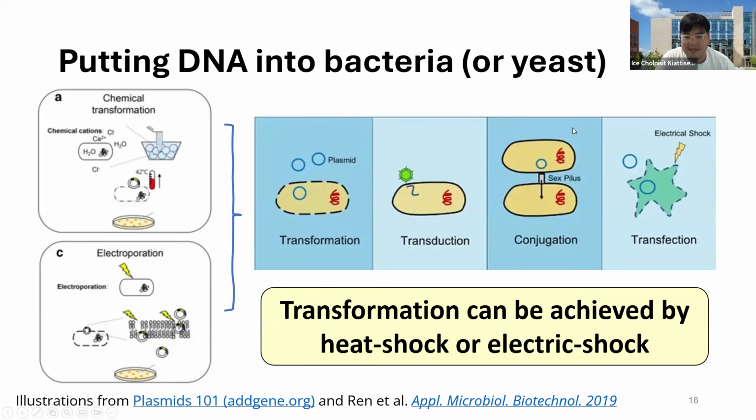I mean, yeast can use some similar processes as well. Most of the time, you will not care too much about transduction or transfection if you are working in bacteria, because those are more likely processes on the mammalian side. But yeah, you will hear a lot about transformation or conjugation if you work in prokaryote biology.